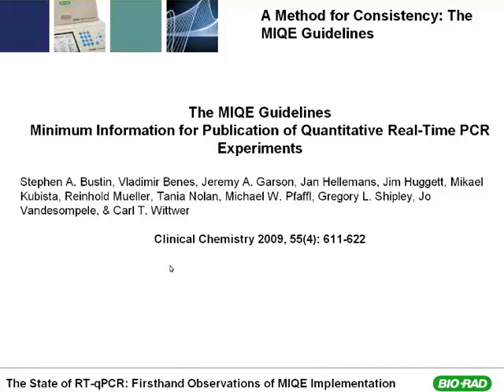These authors have been very forthright in the scientific community to show that a lot of experiments that have been published in the literature not only don't conform to any guidelines for experimental design, but because of that have generated potentially artifactual data in many of these articles, leading people astray in building on the literature published with qPCR.